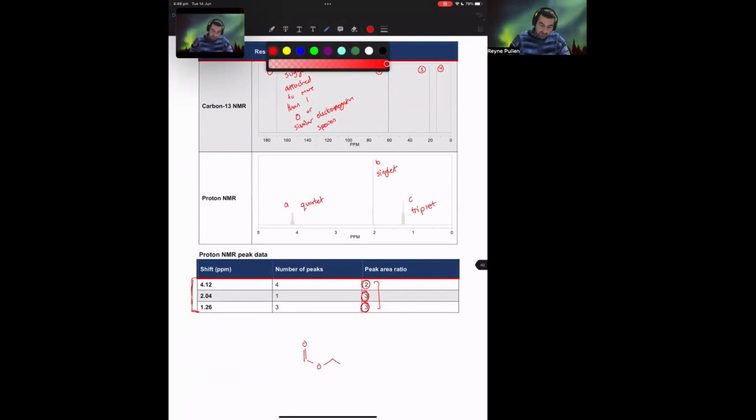And if we switch to purple, this is likely going to be our proton environment A. By that logic, if we have a terminal proton environment to the right of it, this must be C, because it's got a triplet, which means that there must be 2 protons nearby, which would be at the carbon immediately beside it.